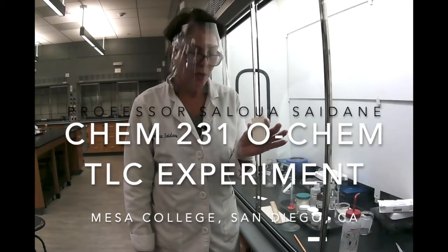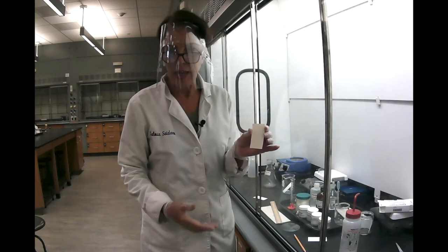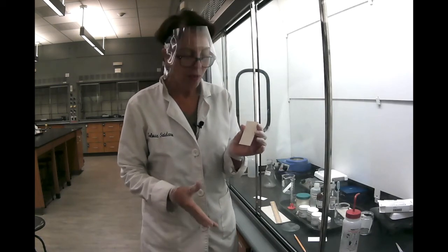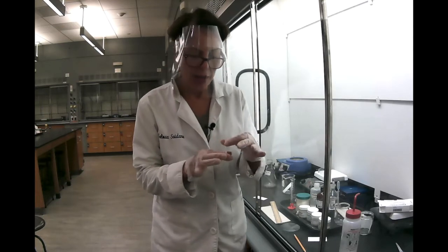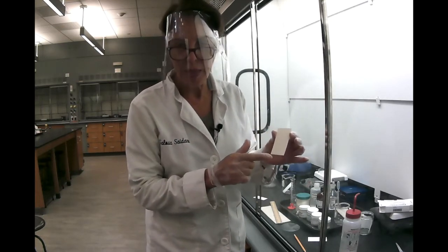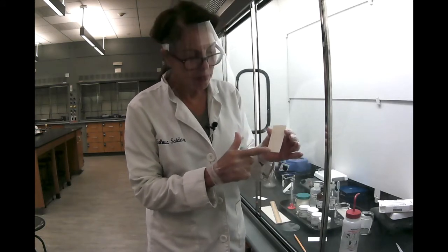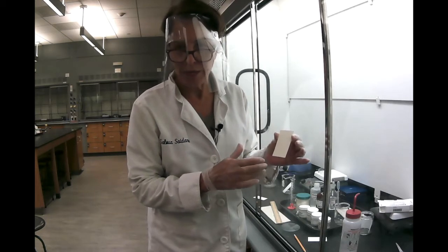So we're starting with TLC today. And what is TLC? It's thin layer chromatography. So what is a thin layer? There is a glass plate here, and on top of it there is a powder. It can be alumina or silica. And this powder is what we call a stationary phase.